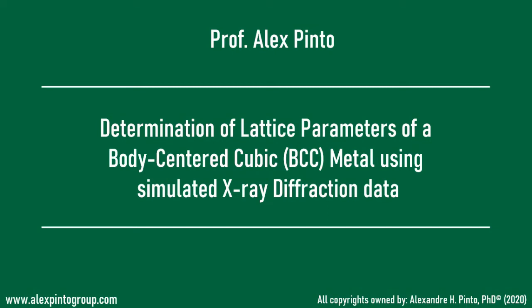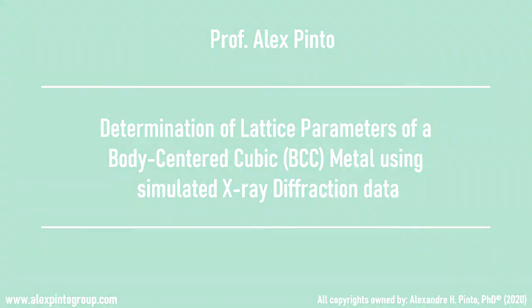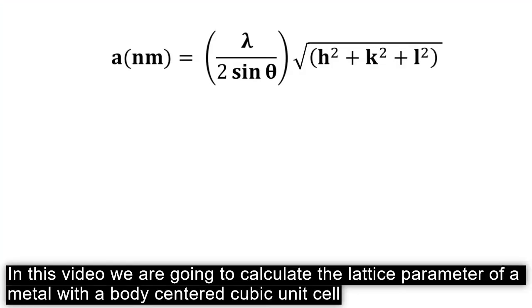Hello, I'm Professor Alex Pinto, and this is the video about determination of lattice parameters of a body-centered cubic metal using simulated X-ray diffraction data. In this video, we are going to calculate the lattice parameter of a metal with body-centered cubic unit cell.